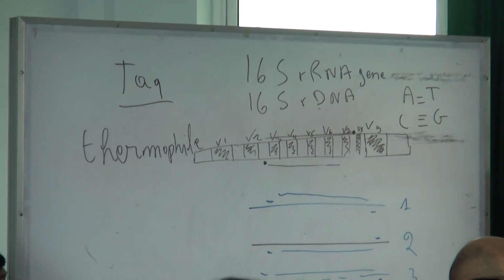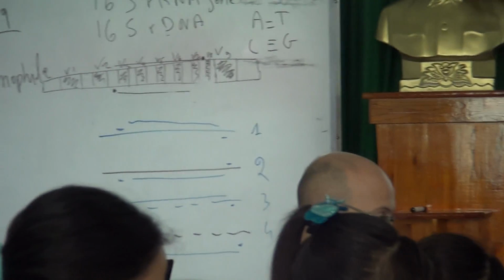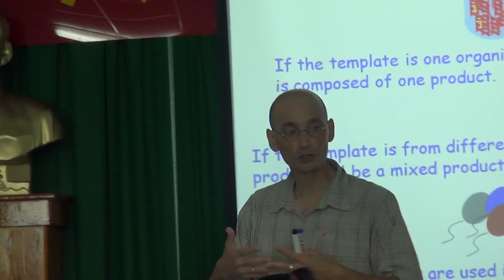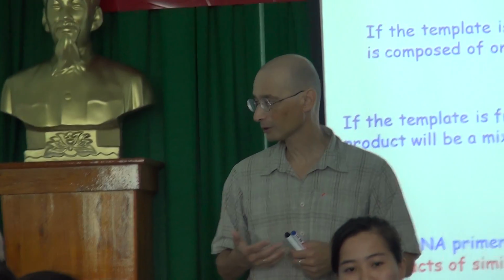It's almost identical. Normally, when you have a DNA product, PCR product, how do you run it? How do you visualize it? How do you separate it? What is the technology? What is the approach that you're using in order to see your PCR product?